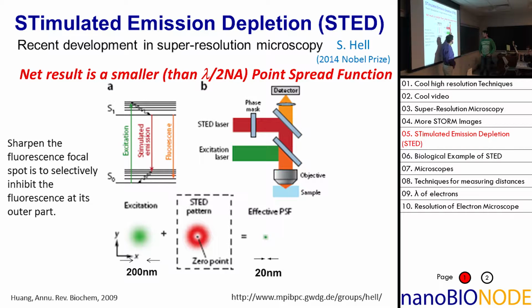So what does this do? Does it reflect it again, or does it do something else? It just passes through. It doesn't do anything to it. So this is wavelength dependent. Okay? So now it's just going through. And in this case, it also just goes through. Doesn't care about it. Okay?